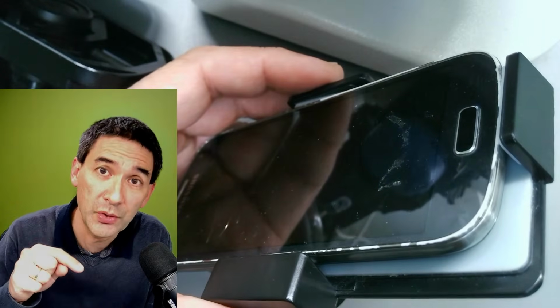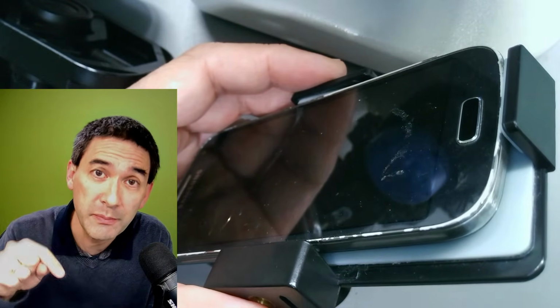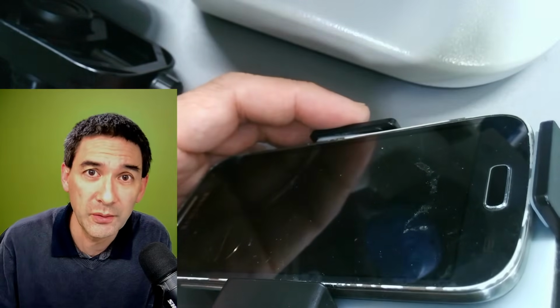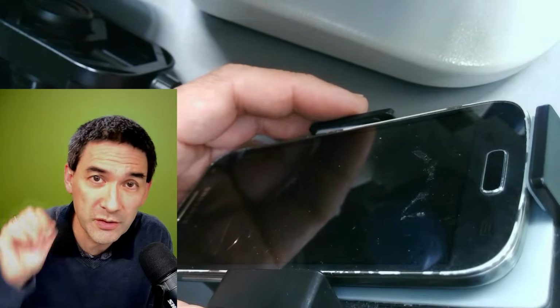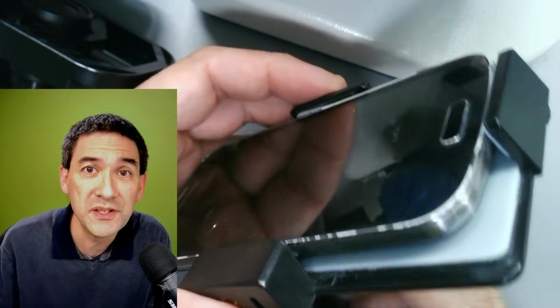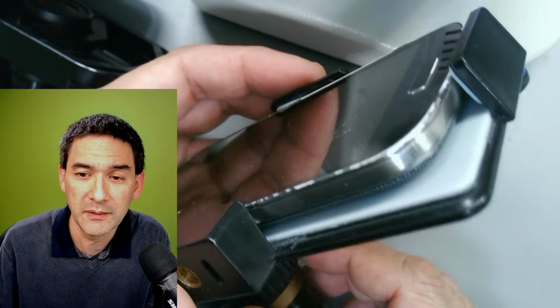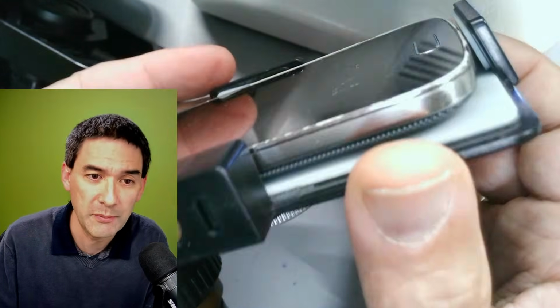The image is being fed into the computer right now. So I'm not recording it on the camera, but it goes into the computer so I can do the live stream, and therefore I always need a USB connector.